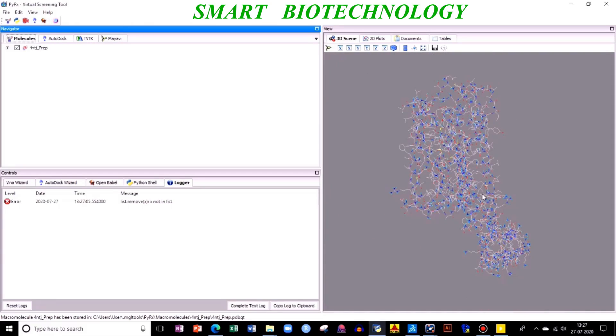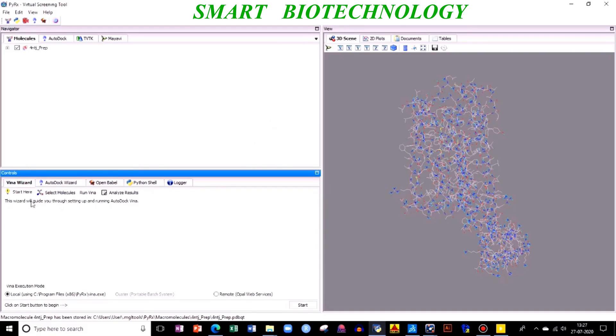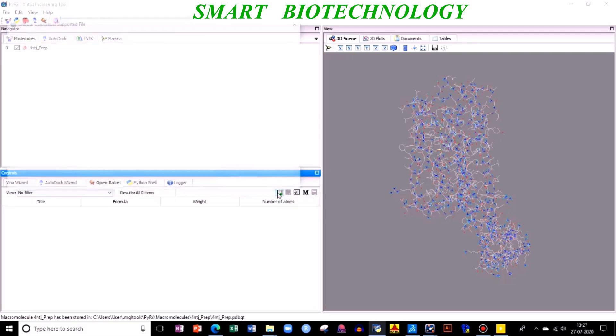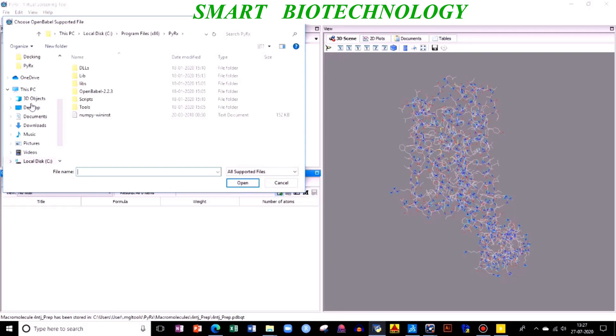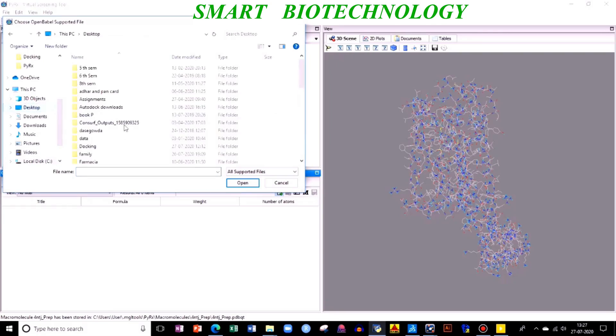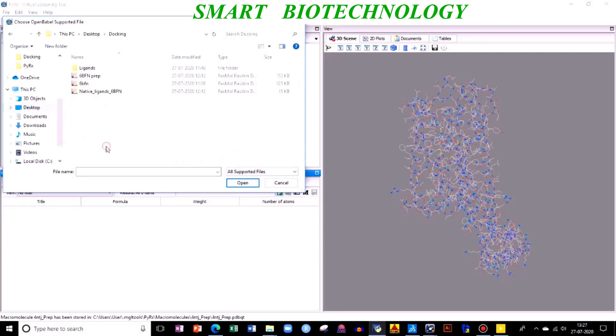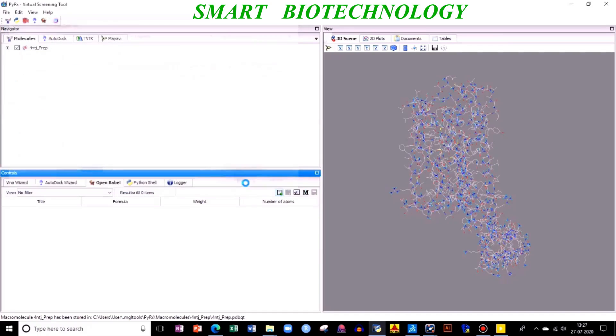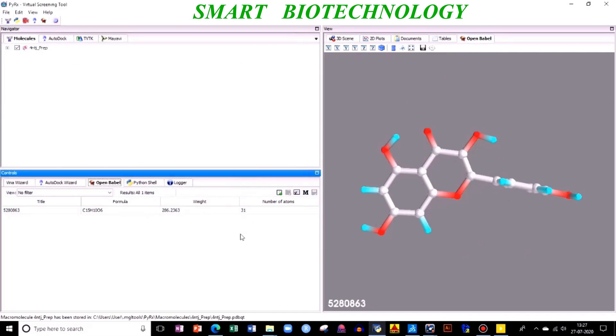Next, click on your Vina Wizard. Then you need to go to Open Babel directly. Click on Open Babel - this is an inbuilt software in your PyRx. Here, insert new item, desktop docking.